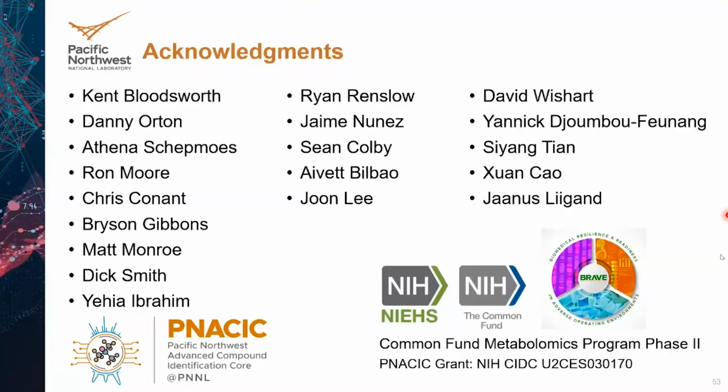Great, thank you. Next question. It's well known that bilirubin can be shifted through different double bond isomers by blue light. Is this something in metabolomics we should be aware of? Does it occur after receiving material for analysis? Yeah, it's a good question. I'm sure there are all sorts of artifacts that get introduced into our samples, not just from exposure to light, but, for example, freeze-thaw cycles and so forth.